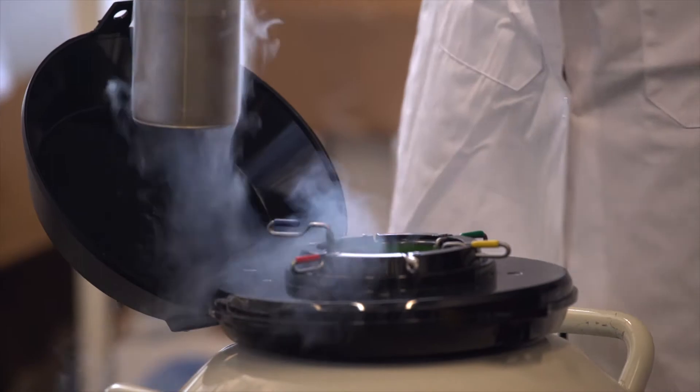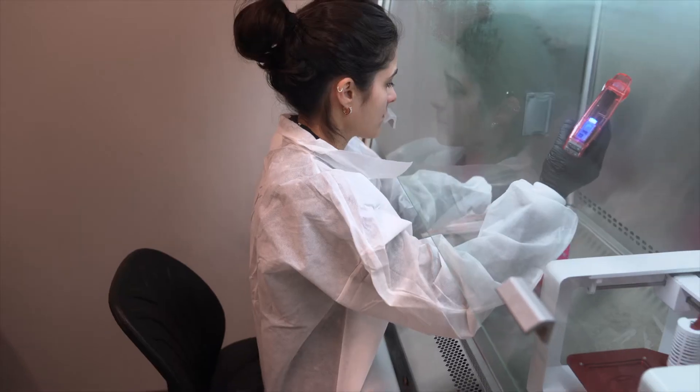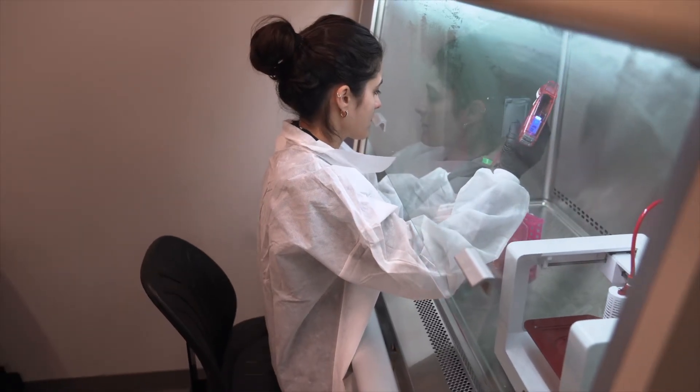Allevi bioprinters make it easier to replicate the human body outside the body. 3D bioprinting allows scientists and users to make new things that haven't been able to make before.